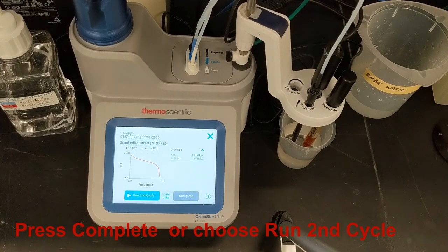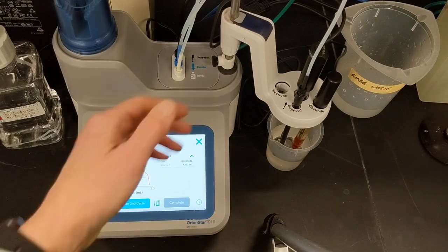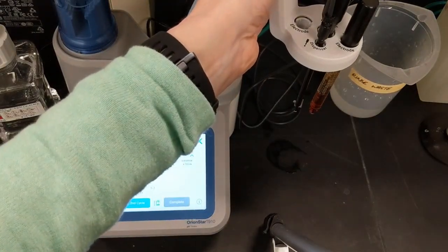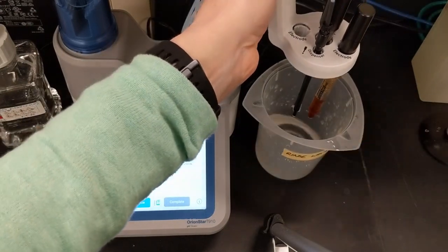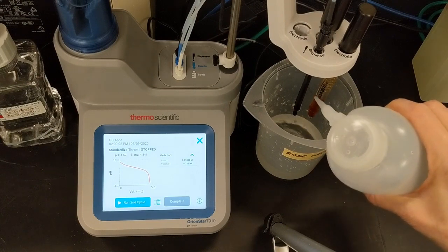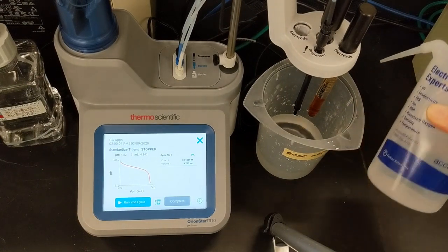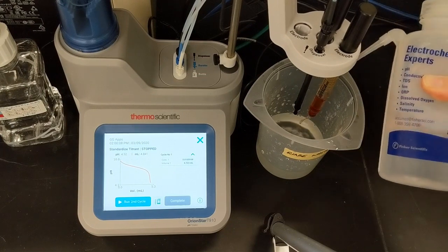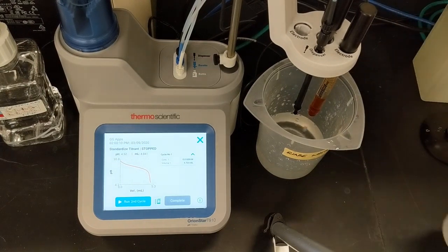When the first titration cycle is done, the results are displayed. At this point, I can touch complete to end the standardization, or I can titrate another beaker of my standard, which is what I'll do. So I'll rinse the dispenser, electrode, ATC, and stirrer thoroughly with reagent grade water to remove any carryover from the first titration. This is an important step for accurate titrations, so I don't rush it.